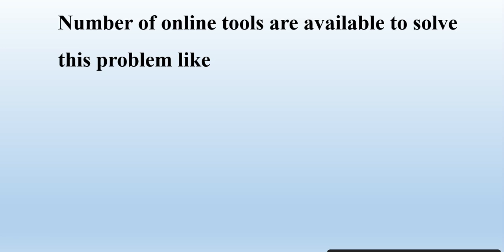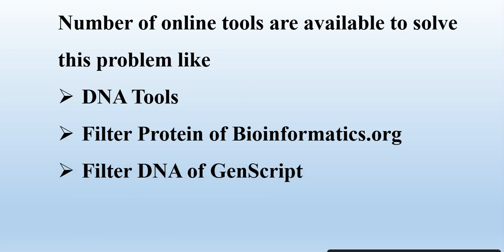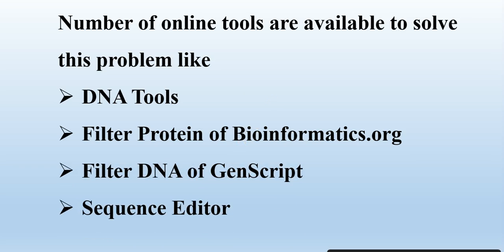There are a number of online tools available to solve this problem like DNA Tools, Filter Protein of Bioinformatics.org, Filter DNA of GenScript, and Sequence Editor and much more. The link of all these tools are available in the video description. So how to use these tools to remove the number and space from the DNA or protein sequence? Let's start.